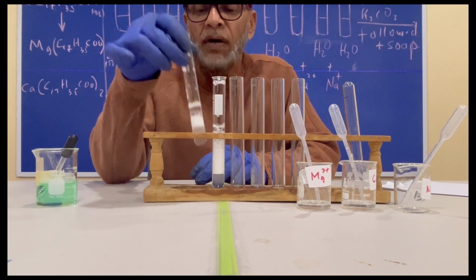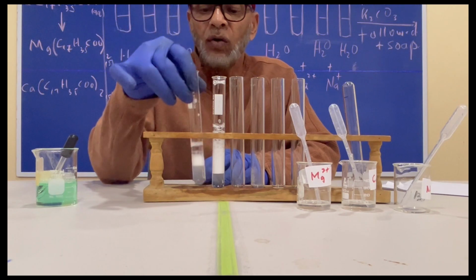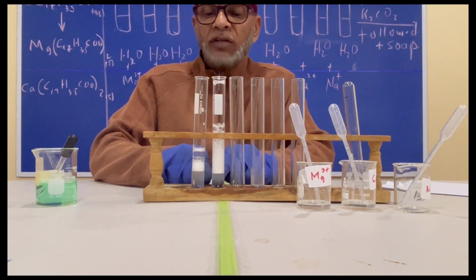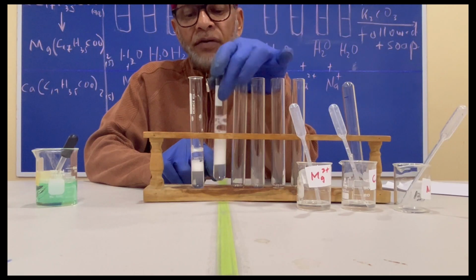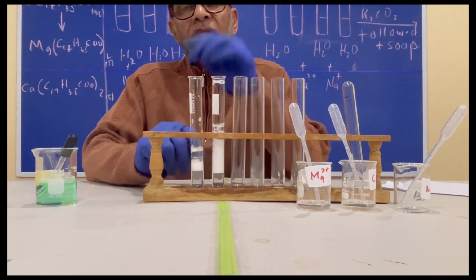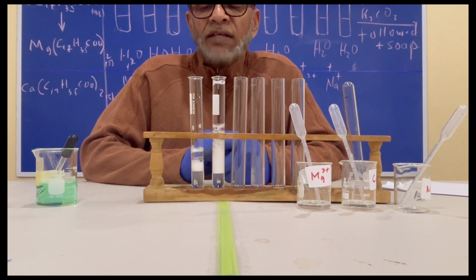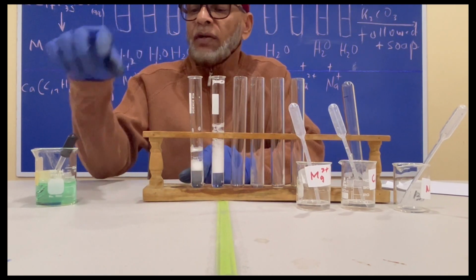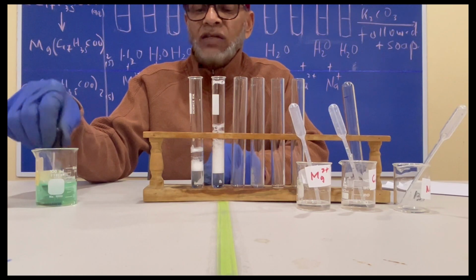This poses a problem for a guy who is operating a laundromat. What you're seeing here is that an equal amount of soap was used, but this one here produces more lather than that one. So the degree of lathering is an indication of how well the soap will work. So let us see how this one could achieve the same degree of lathering as this one here.